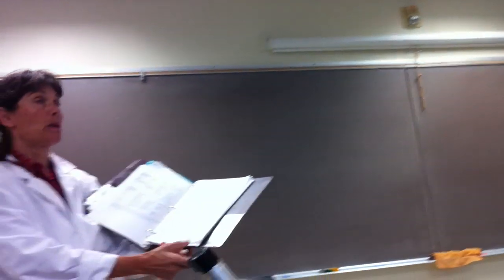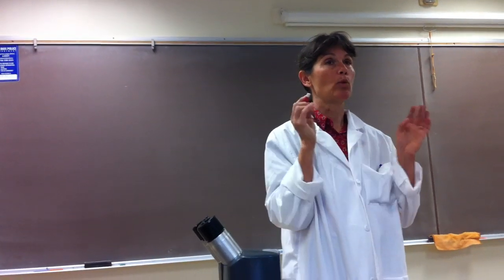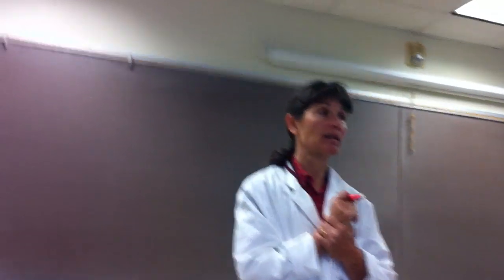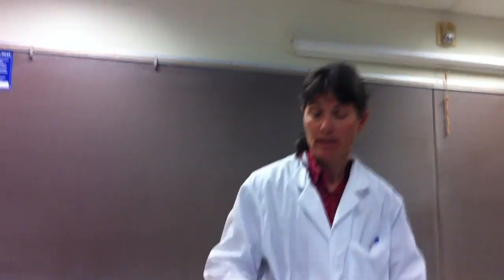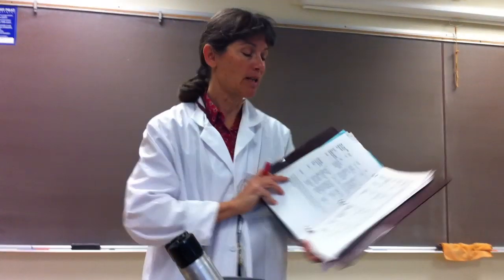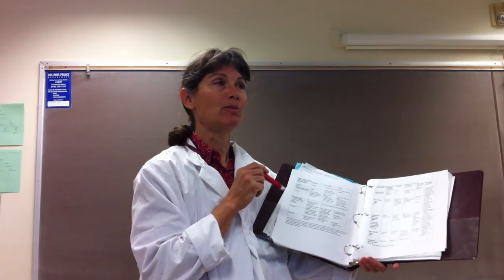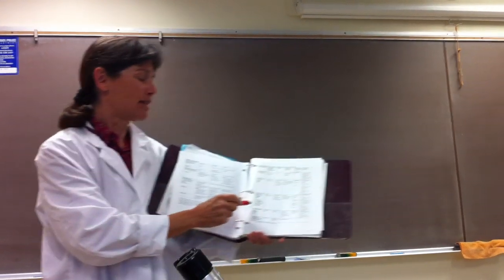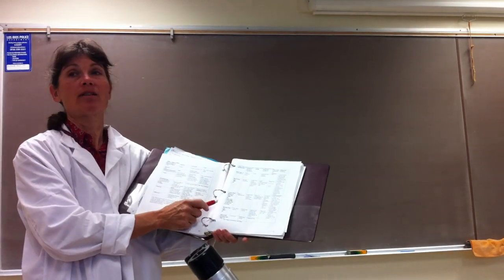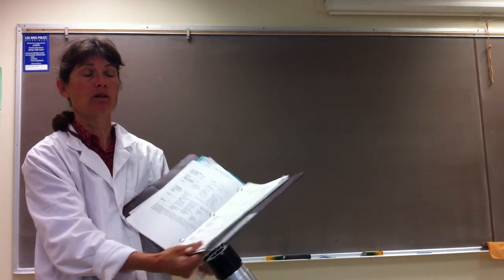Now, one of the slight issues was I thought we were going to have McConkey's media, but we don't. We have Eosin methylene blue media, and I know I asked you guys to prepare the McConkey's. I asked you to read about McConkey's media. So on the lab practical, there'll be some bonus questions on McConkey's media, so you don't feel frustrated like you studied it for nothing. And what I'll do is I'll first tackle this Eosin methylene blue media because it's one of the more complicated media that we're going to work with.